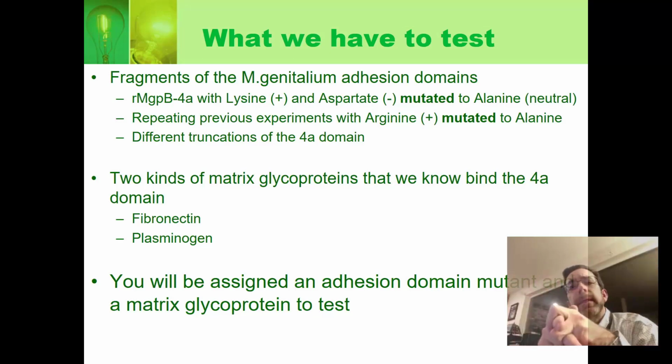The other thing they've done is they've taken particular amino acid residues and they've mutated some of them to remove the functional group, remove the charged group, to make it boring and neutral. And we found out that sometimes the protein doesn't care if you do that. For some residues, the protein really cares. And that tells us that that residue is important to binding. Hey, we better zero in on it. Maybe if we can block that residue, we can block binding.